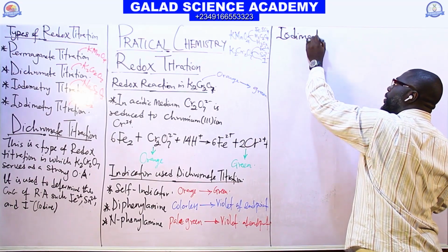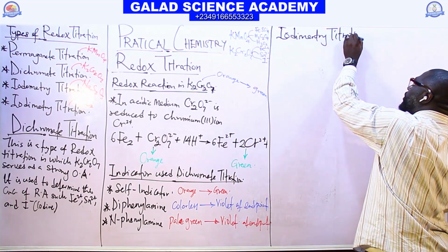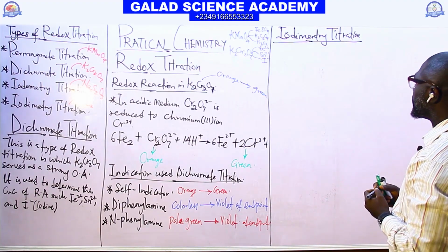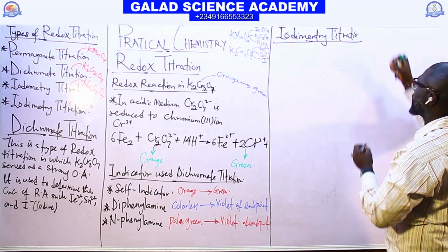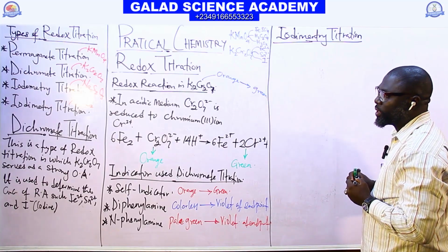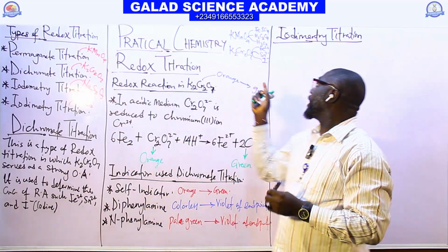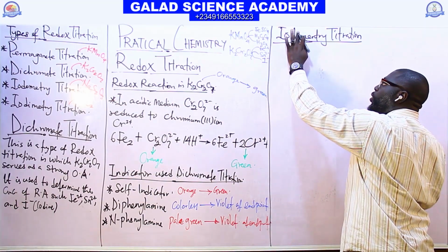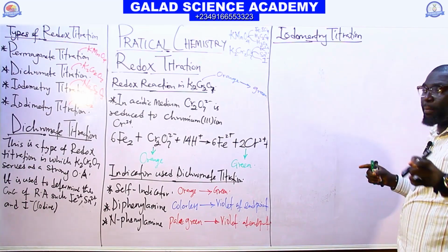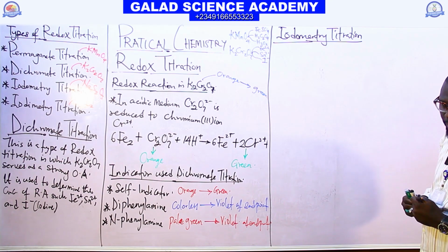No, I'm having iodometry before iodimetry. Yes, after iodometry, we go to iodimetry. So if you are talking about iodometry, what is iodometric titration?